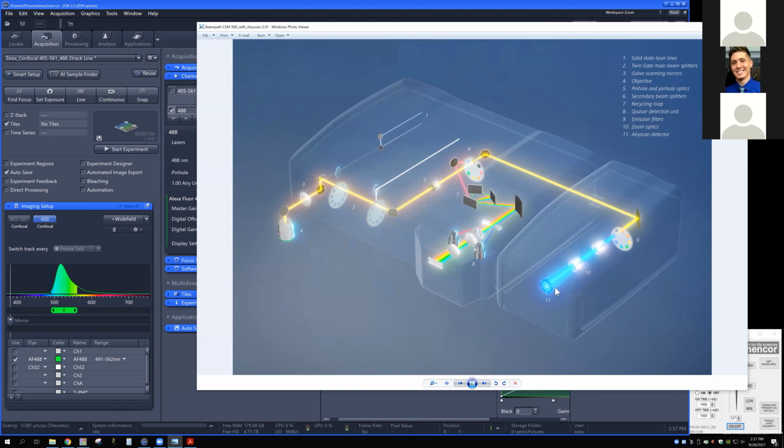But for the Airy Scan detector, we're using space to help us improve resolution and sensitivity. Because we can't work with spectral separation here, we use regular filters to send exactly the wavelengths that we want, but with less control than we have in the confocal detector scan head. Does that make sense?